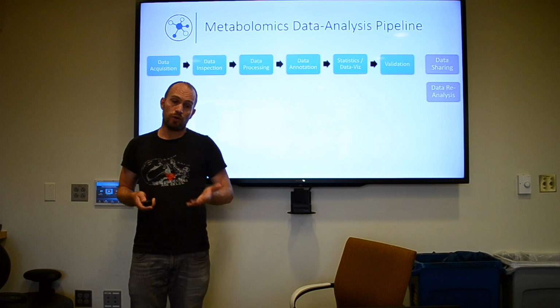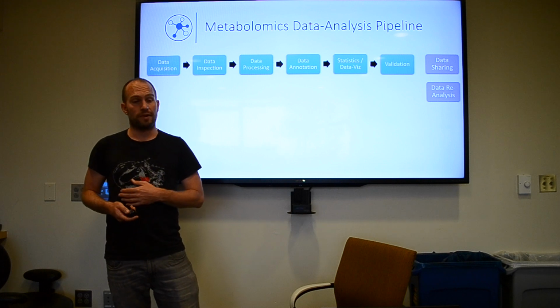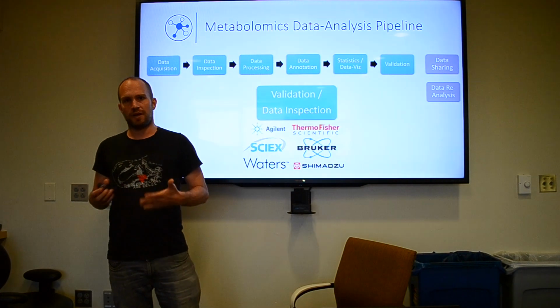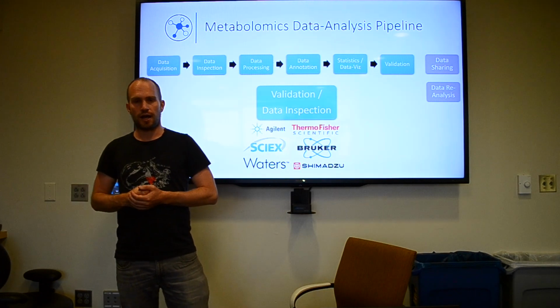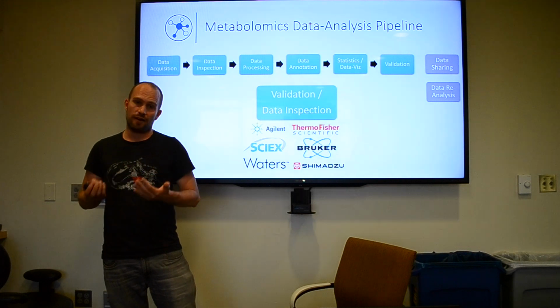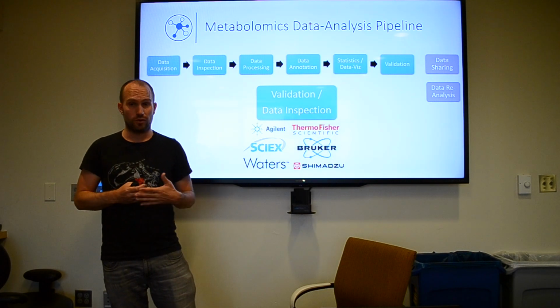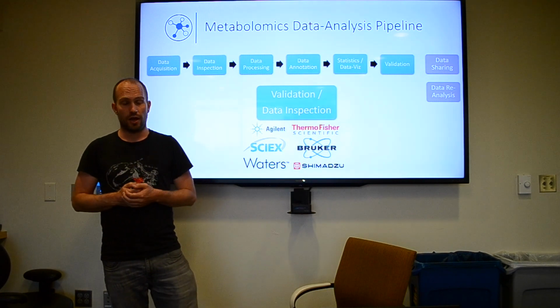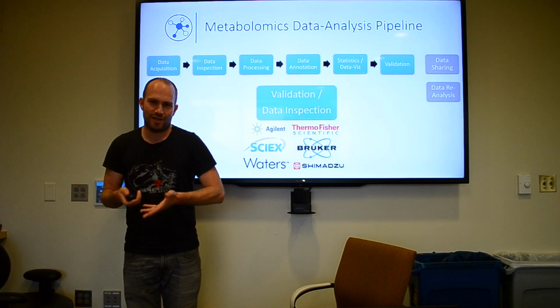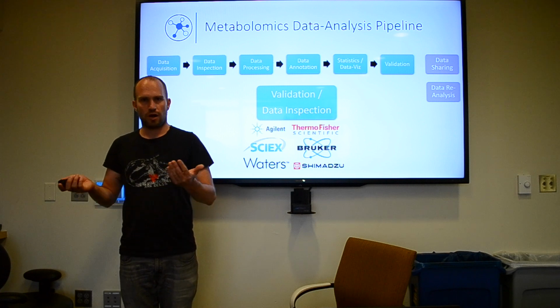The most critical part there is probably the final validation of data, which, especially for the different vendor formats, people are locked down to a certain file format. Then they have to have the software downloaded or converted to an open viewer, and then get access to the raw spectra or chromatograms.